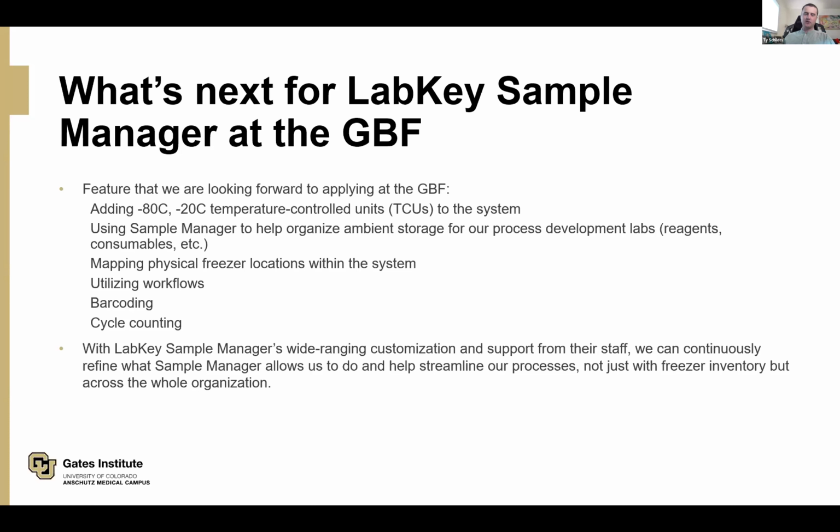And some of the things that we were looking at is adding our -80 and -20 freezers to the system. Currently, we're only using the LN2 freezers, but just because of the really sensitive nature of -80 Celsius samples, you don't want to have those doors open too long either. So being able to really map those, I think, can really ensure the integrity of those samples that are at -80.